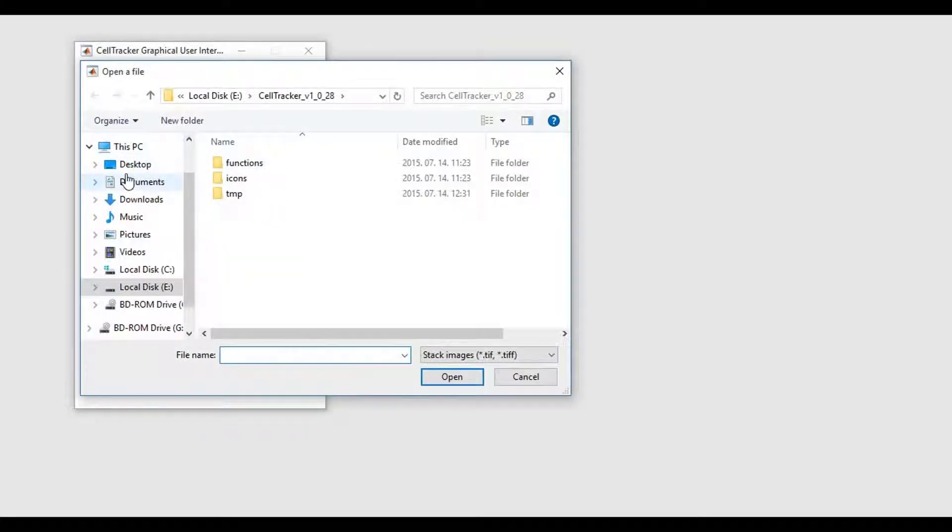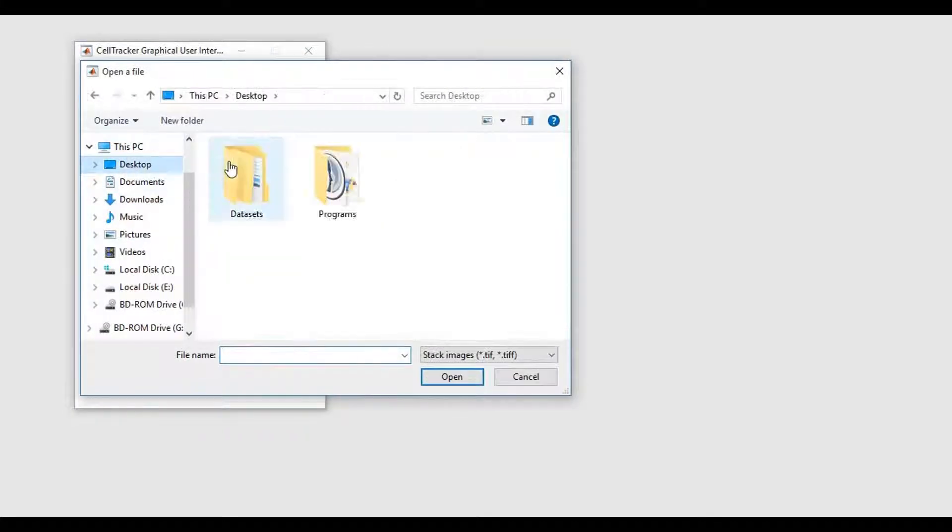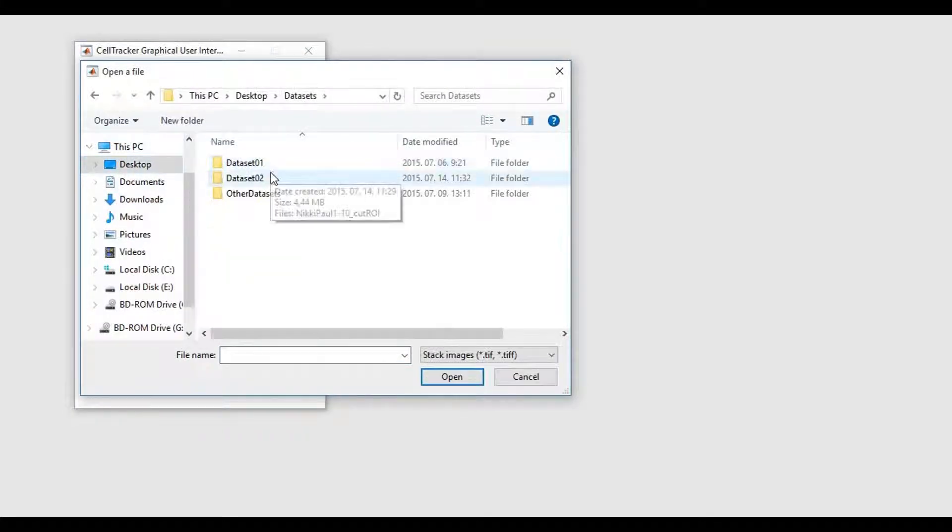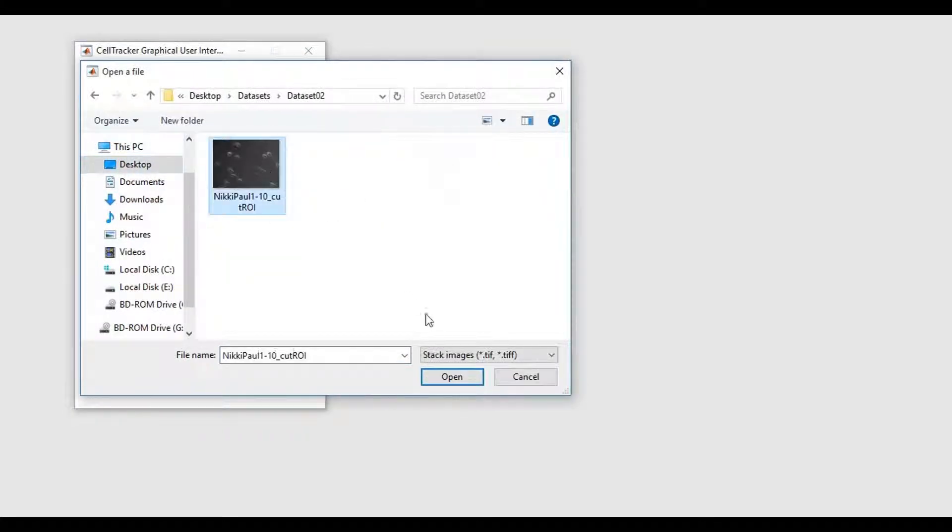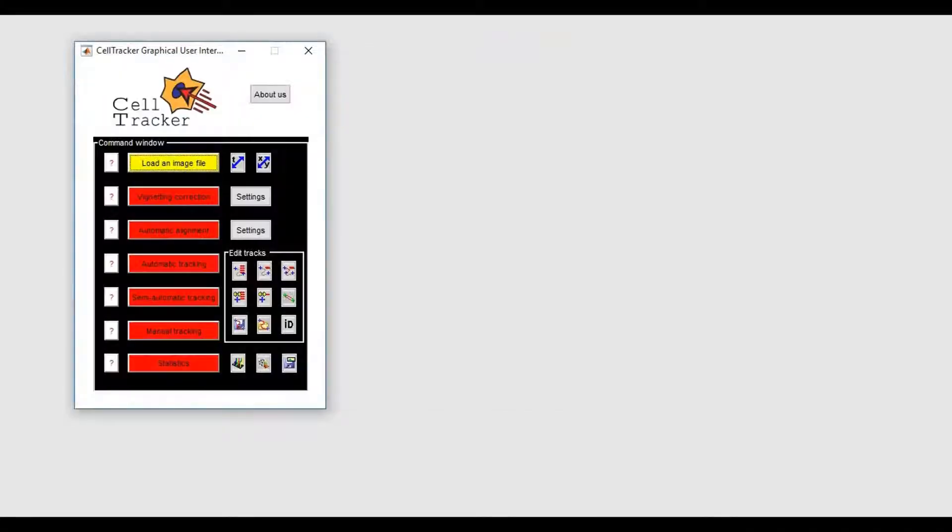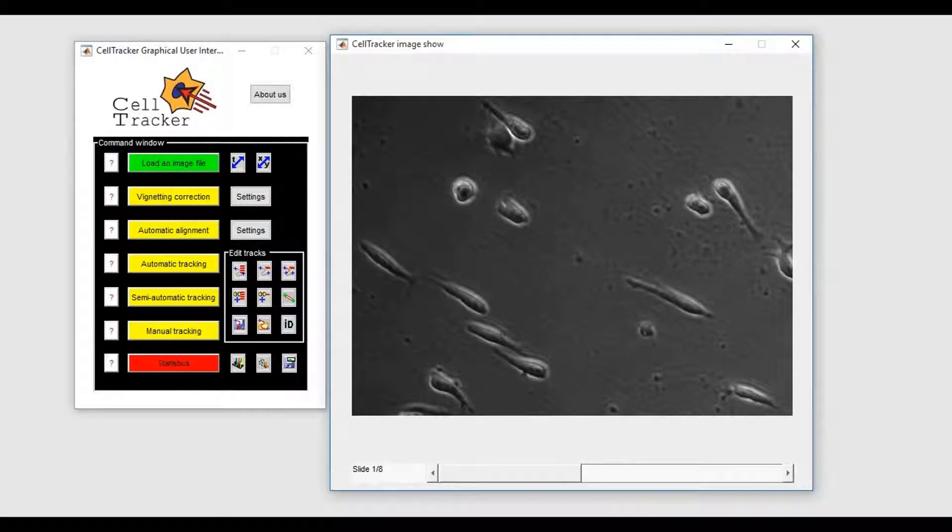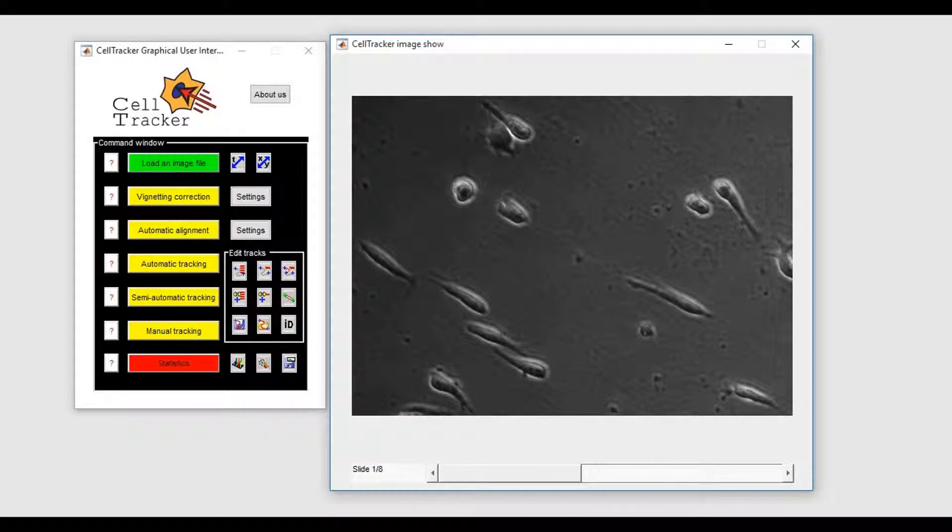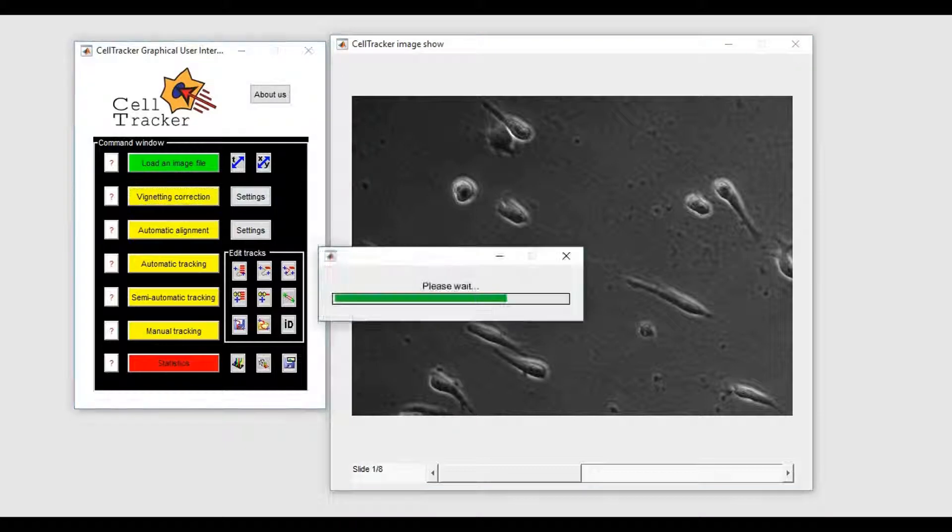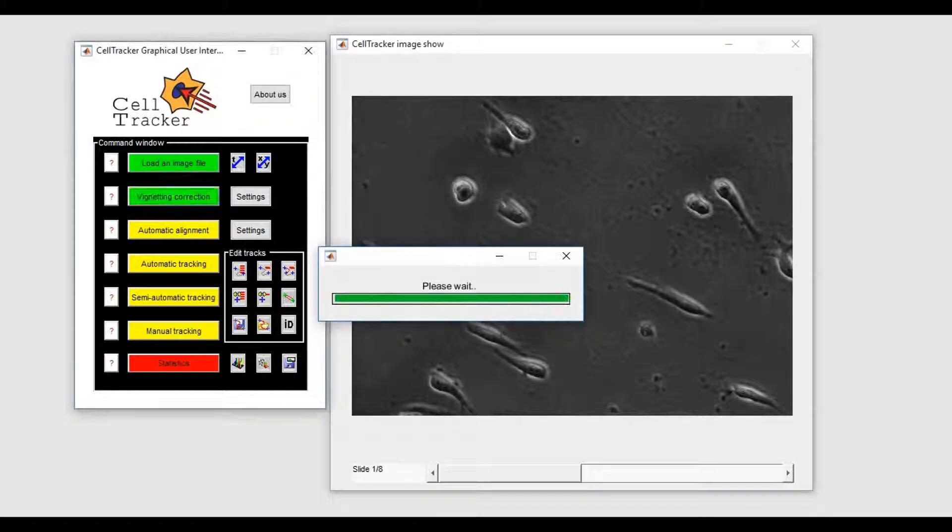Let us load a set of images. Any microscopic image has a certain degree of uneven illumination which may affect cell tracking algorithms. Accordingly, we suggest that you always perform vignetting correction.